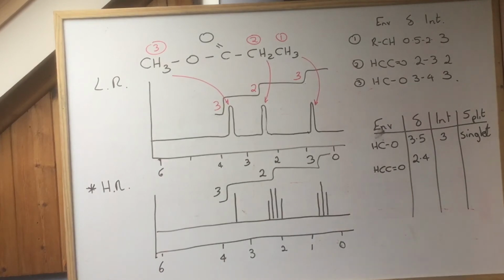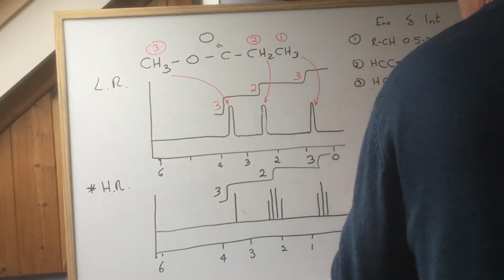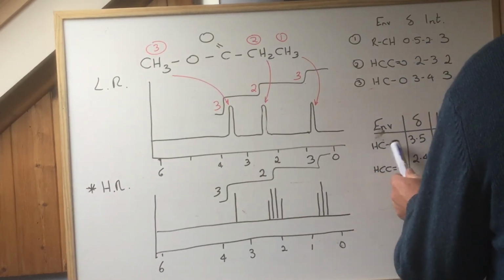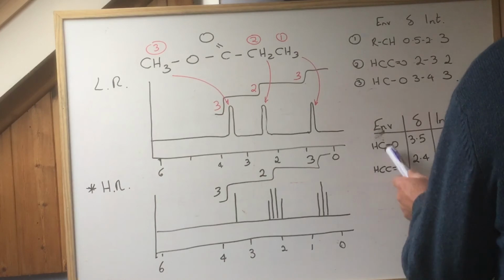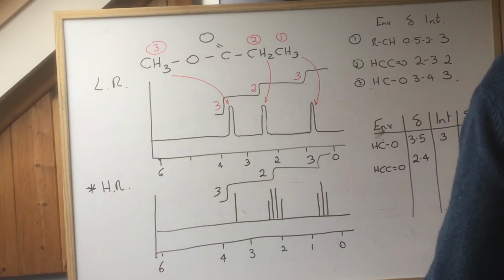There are other things that can occur in that, but you have to use a bit of this. So it's telling me that there's that group there, which I would expect. I'm thinking now that this is an ester, because it's got all the ingredients for an ester, particularly those 3 being isolated in a singlet.